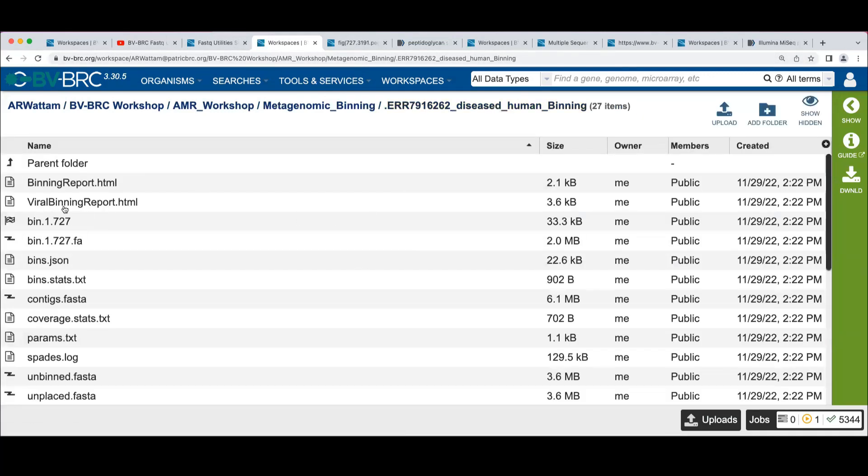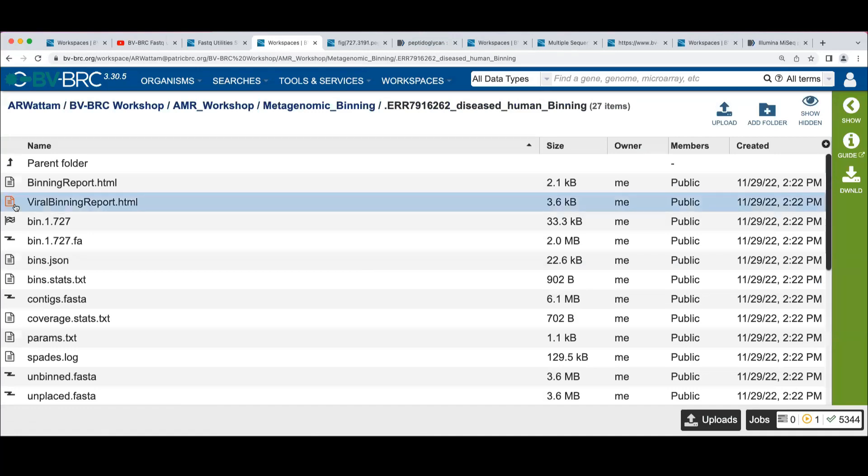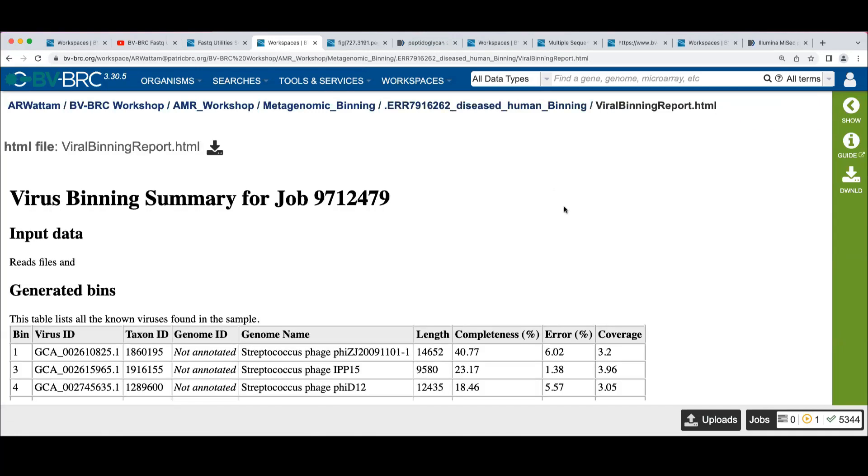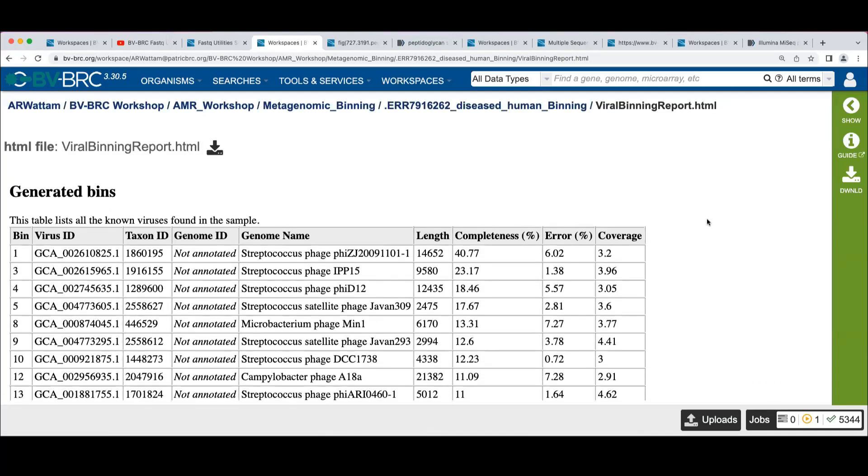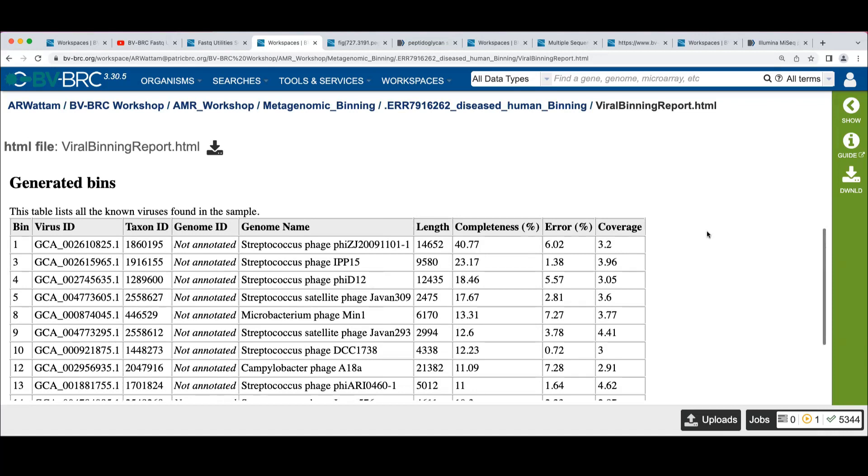We also look at the viral binning report. This one isn't nearly as interesting because we don't have as much data on the viruses. Like I mentioned before, this uses CheckV to try to identify bins as belonging to a virus out of the IMG database and one of the NCBI reference databases.